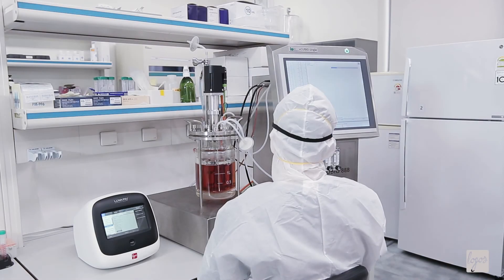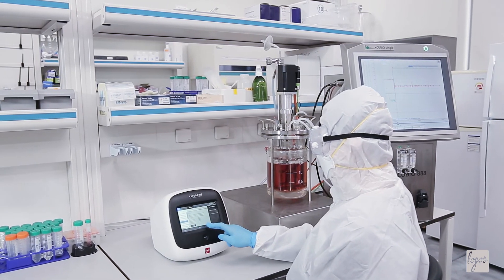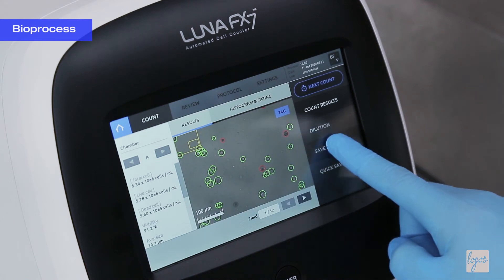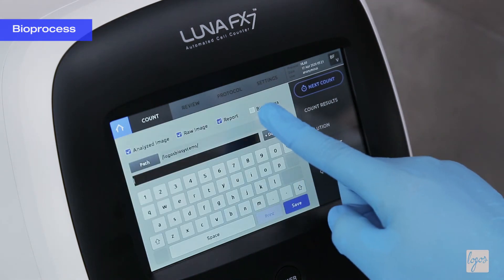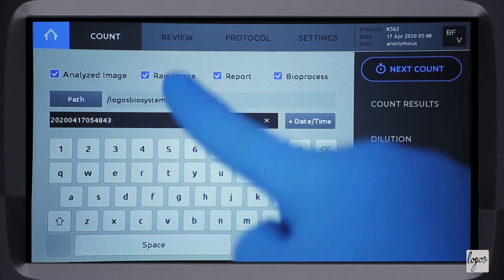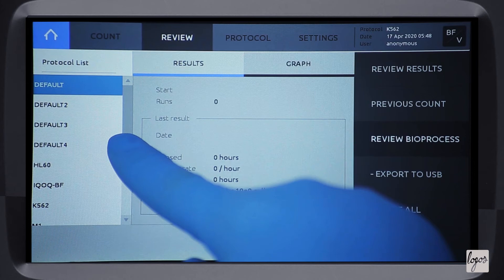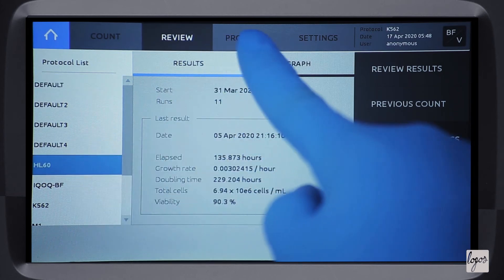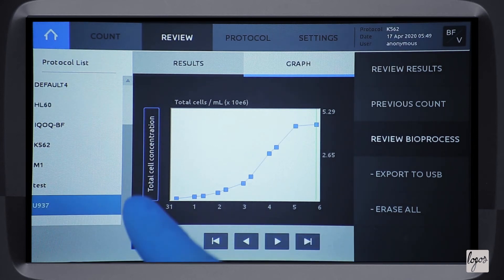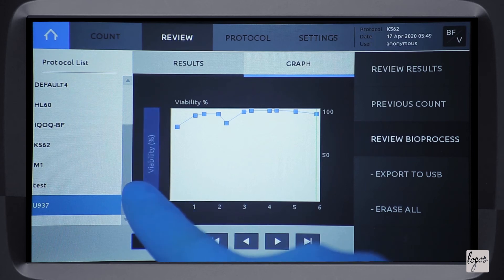To better accommodate production and QC/QA cell counting needs, separate new features are available. In the BioProcess mode, the LUNA FX7 allows you to monitor the progression of multiple batches under separate protocol names. This feature calculates doubling times and charts proliferation curves, allowing you to trace production, monitor the health of your cells, and more easily schedule downstream activities.